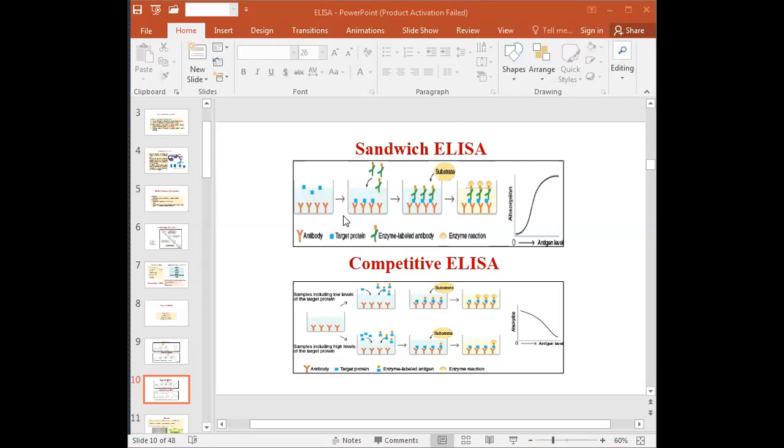Since two antibodies are used, the antigen is specifically captured and detected. It's not that a small amount of antigen goes unidentified by the antibody. Mostly in the case of a complex sample, since the antigen doesn't require purification prior to measurement, we can use the sandwich ELISA process. And due to its flexibility as well as its highest sensitivity, this type of ELISA method can be used ahead of the direct or indirect ELISA technique.